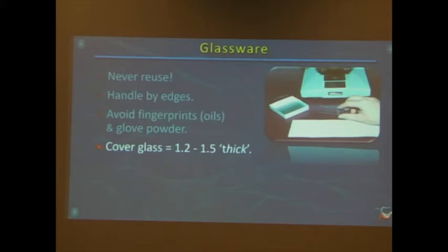You need to use a particular thickness of cover glass with phase contrast. It has to be 1.2 to 1.5 thick. That doesn't mean thick. Thick is an optical measurement in the glass industry. So it's like inches or pounds or meters. It's thick.